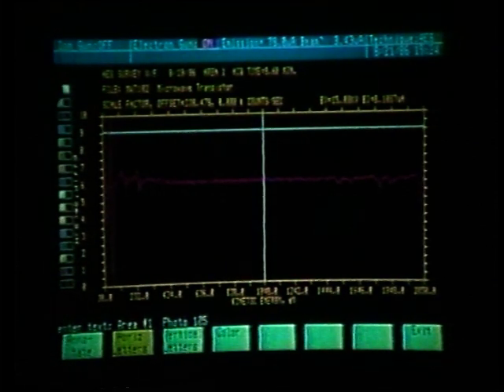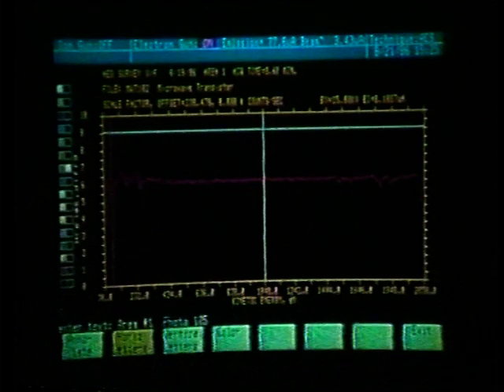That is our color selection indicator. By pressing soft key number 4, I have now moved the white bar on the right to the bottom. By pressing soft key number 4 again, I can toggle the white bar selector to whichever color I would like to write on our graph.